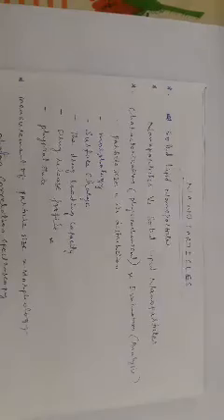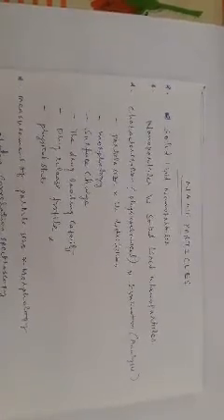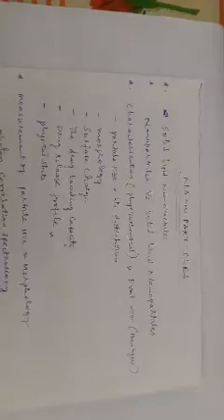This information is commonly used to shorten development time, to improve the stability of colloidal as well as emulsion formulations, and to assess the level of aggregation in the dispersion or colloidal systems. All this we have already discussed.